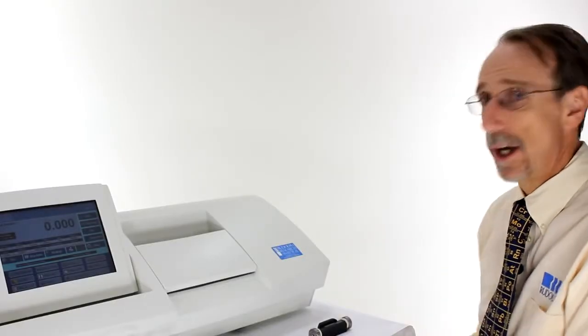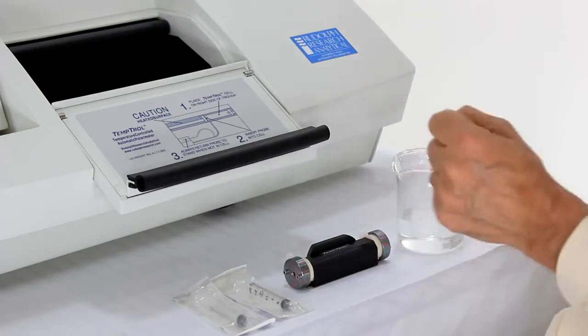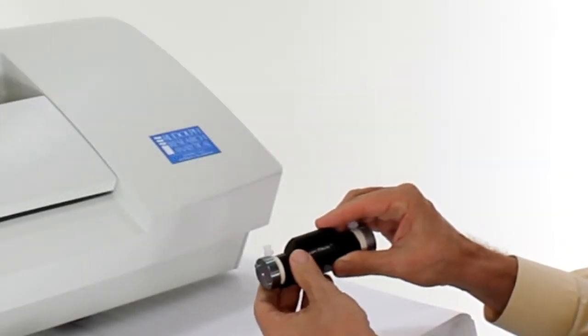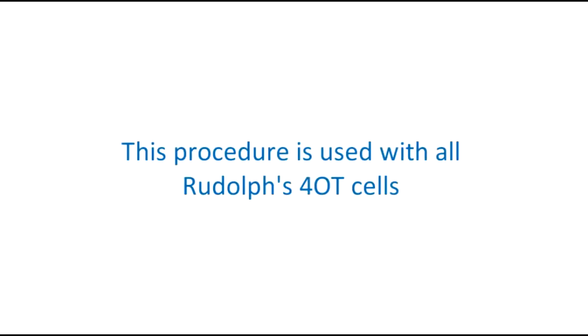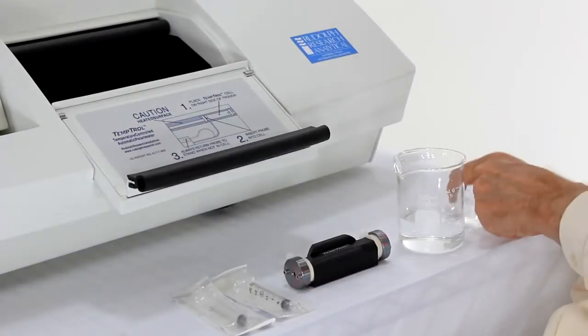Before making the measurement I prepared the following: two 3mm syringes, a 40T 5100-2 cell, the blank and the sample to be measured.